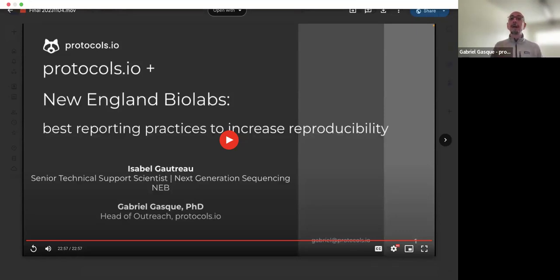So if you are creating a protocol and you want to add a reagent that is not already in the database, you can create your own, and that will be added to the database for other users to use as well. But the list is not comprehensive. And as vendors are developing more reagents and equipment, we are catching up, but the database is not comprehensive.